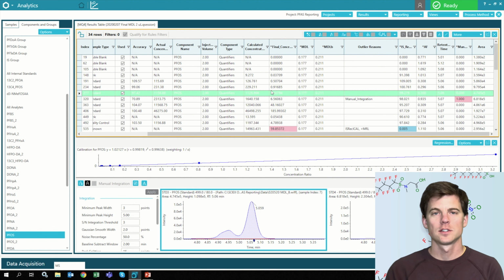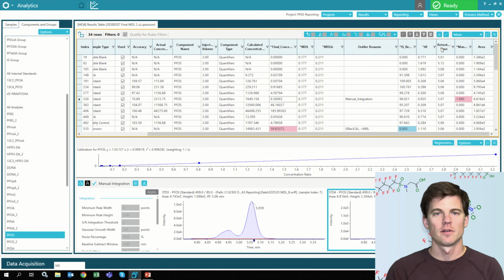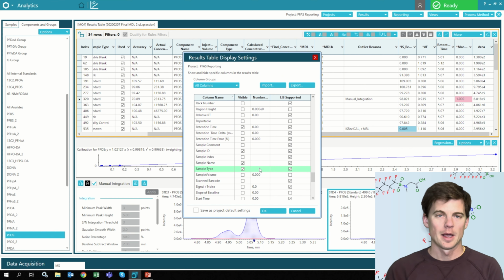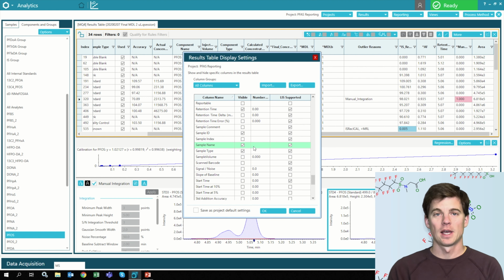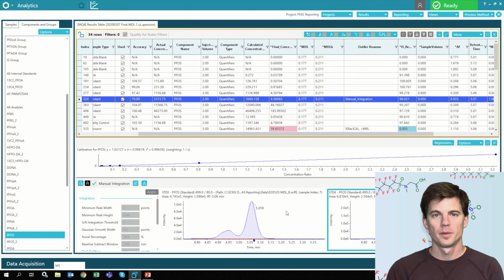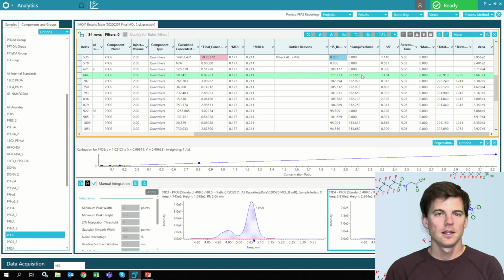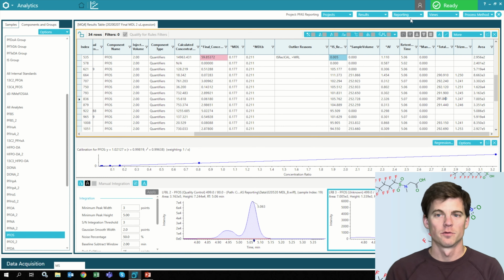We have custom calculations that will take into account your sample volume, your sample mass, dilution factors, and that's what that final concentration is. We're calculating the concentration in the sample bottle. So I'm going to show you here the sample mass and the bottle mass, Trizma mass. If you need to, you type in all these masses when you submit the samples, they'll all show up here and you can use them all for custom calculations to get that final concentration.